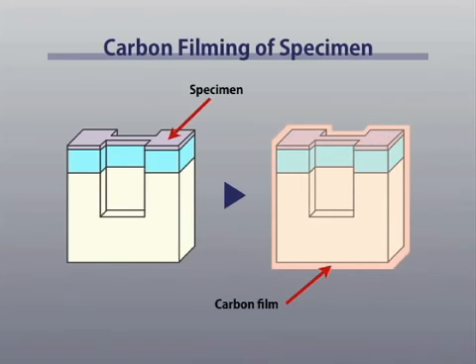To the contrary, if it is too thick, the electron microscopic image will be blurred due to the absorption of electrons by the thick carbon film. So, we face the dilemma of choosing either thicker carbon film for shape maintenance or thinner carbon film for high-quality image. Now is when the high-voltage electron microscope exerts its ultimate advantage.